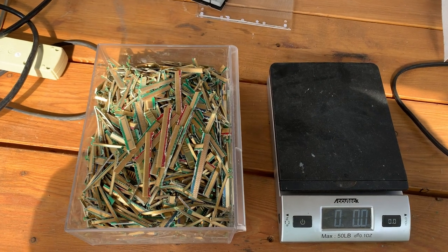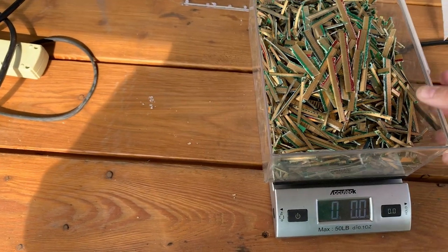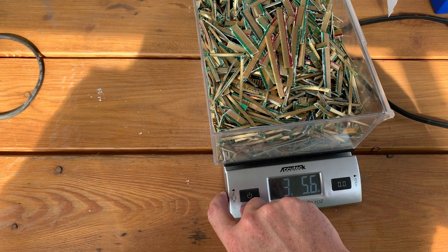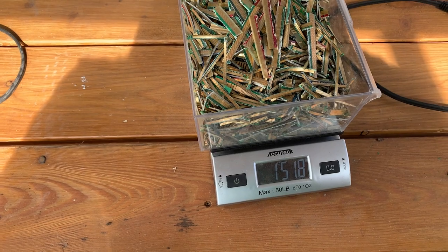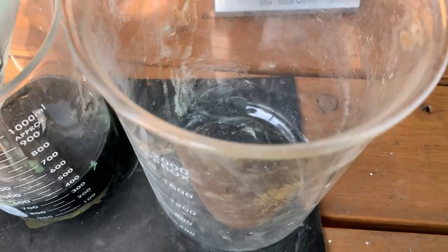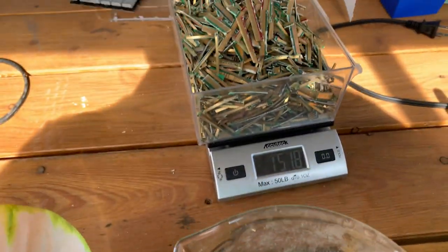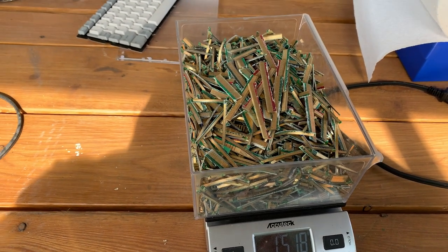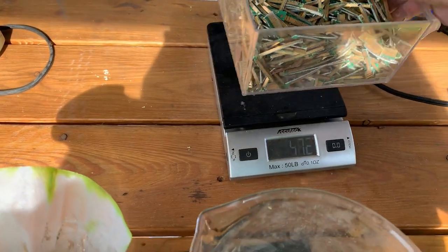Welcome, I'm Anthony, this is Bad Idea Metals, and today we're going to continue what I was talking about in the last video. I actually don't know the weight of the container until I pour all of those RAM fingers and video card fingers off into this two-liter beaker. We're going to cover that with hydrochloric acid and peroxide and let them sit for about a week, so we might as well get this process started.